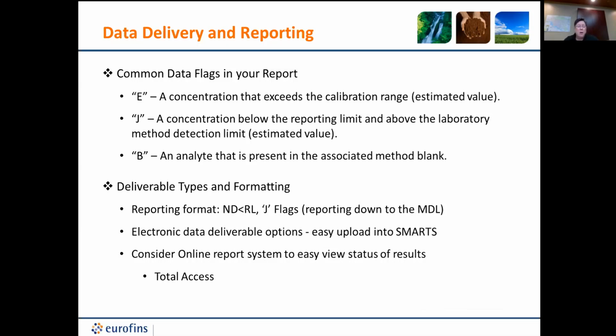Normally we would do some type of corrective action in the lab if we have sufficient sample and holding time to re-prepare and reanalyze that to try to get you what we call clean data, but flags, they will show up. And again, reporting formats.